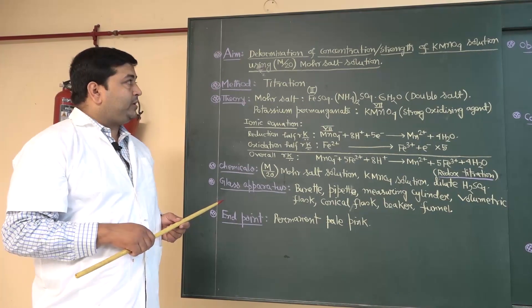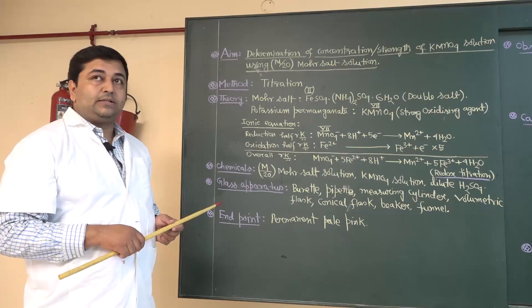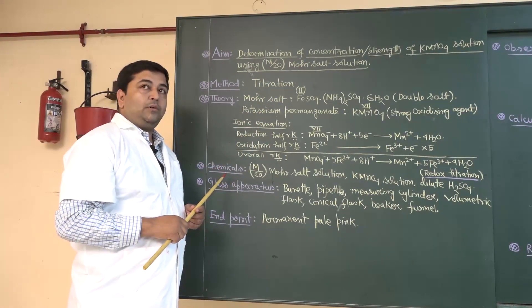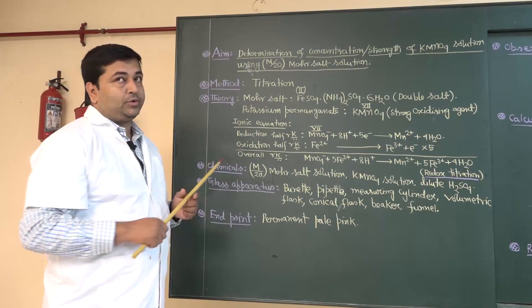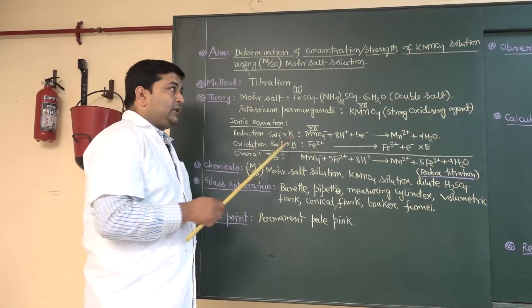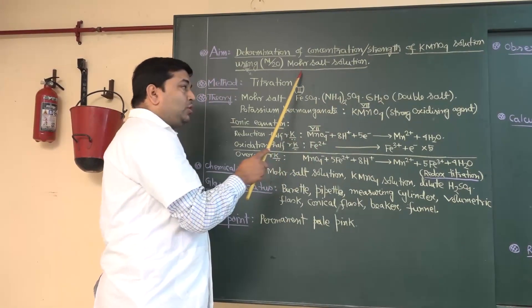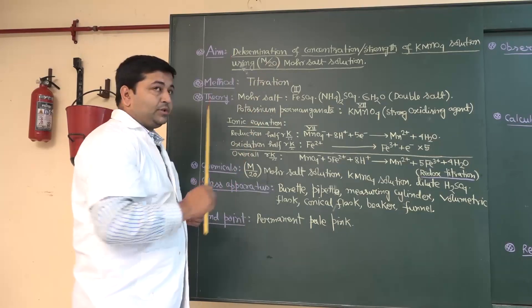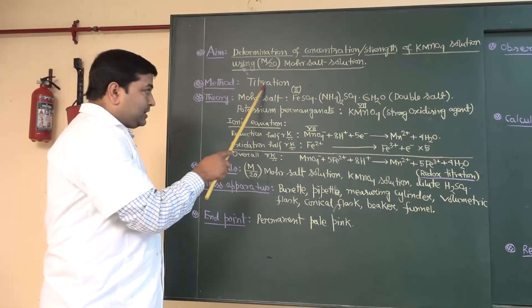Hello students, today we are going to perform one practical. The name of the practical is determination of strength or concentration of potassium permanganate solution using Mohr's salt solution. Ultimately we will determine the unknown strength of potassium permanganate solution using known strength Mohr's salt solution, and the strength is M by 20. We perform this practical by titration method.